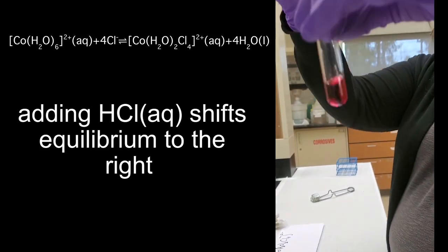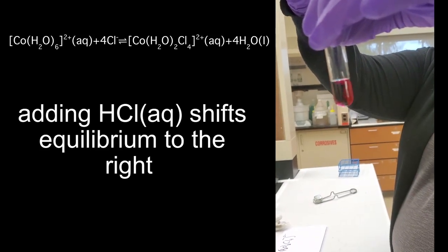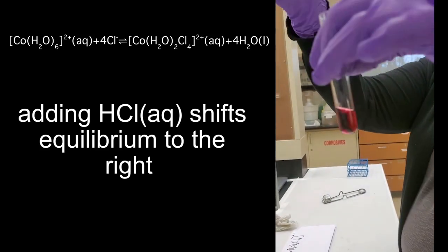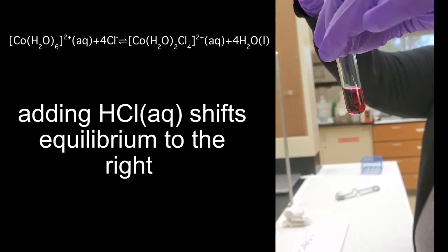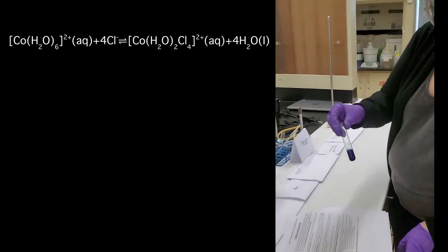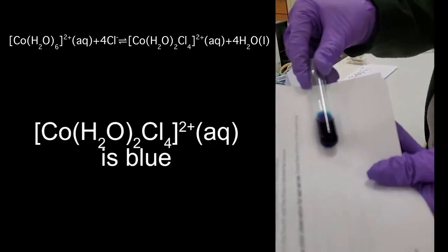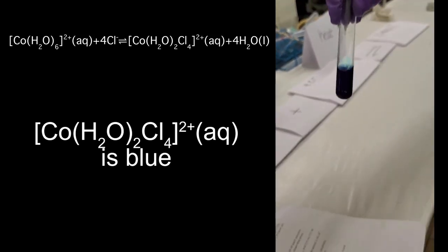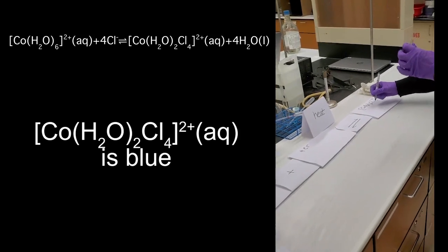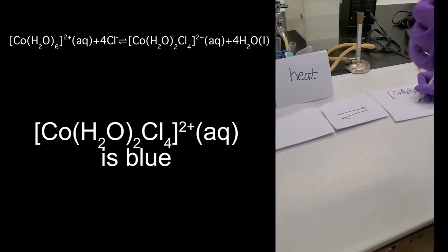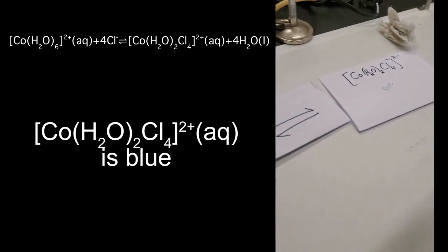Are those colors showing up as it's dropping in? You can see it down the side. Nine, ten, eleven, twelve, thirteen. I know the procedure says don't add too much, but I'm just going to add a bunch because I really wanted to see what color that is. If I'm looking at it on a background, it's got a rich blue color. So that tells me that this one here is deep blue — I've just established that.